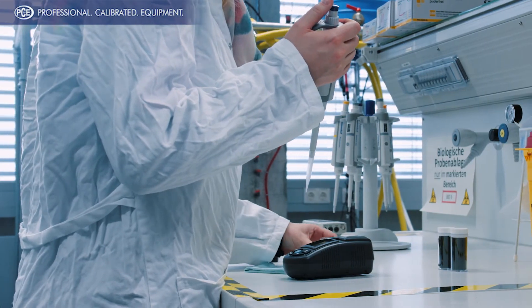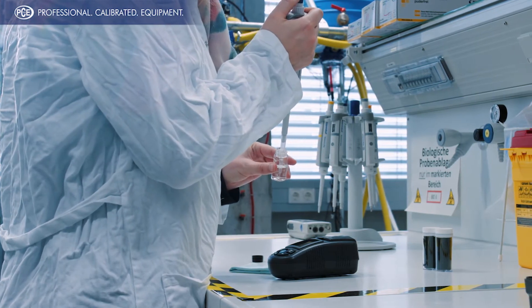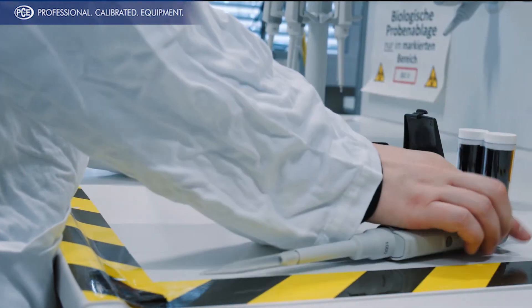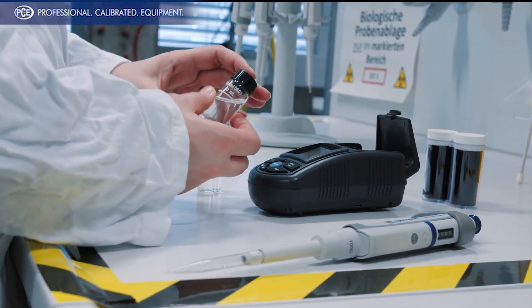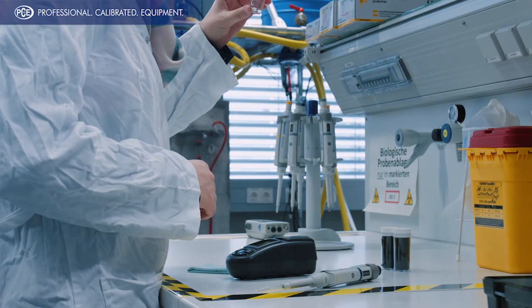The determination of cloudiness is indispensable in water treatment plants, food production, or sewage systems. These different parameters apply to each industry and cloudiness values. For consumption, the water should not only be optically appropriate, but also safe, and that is why the cloudiness should be held to a minimum.